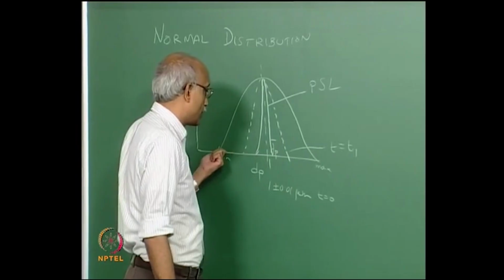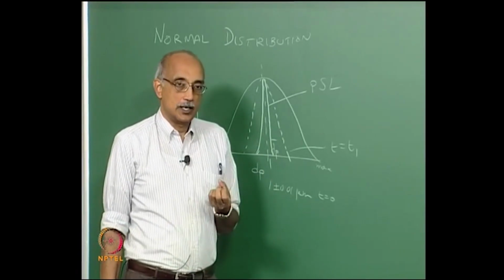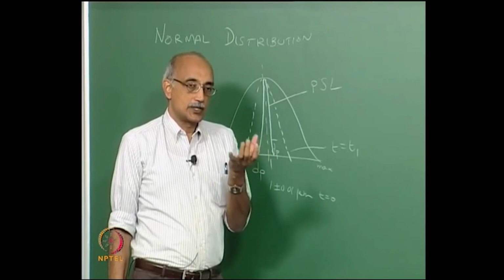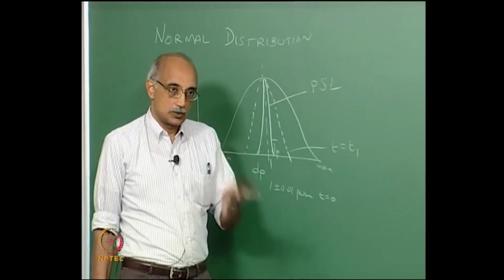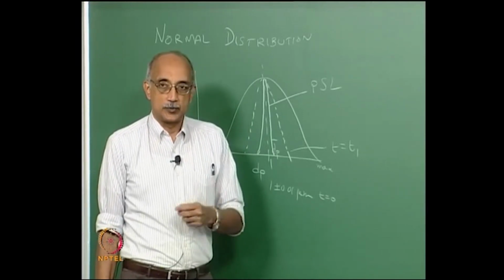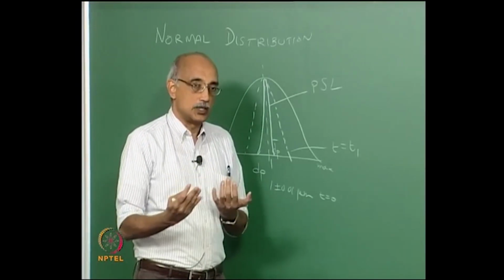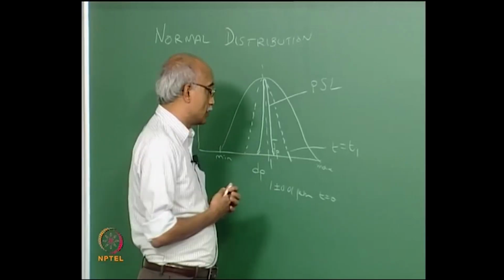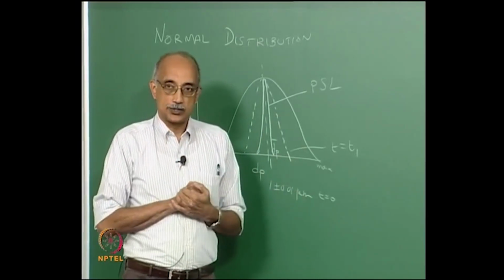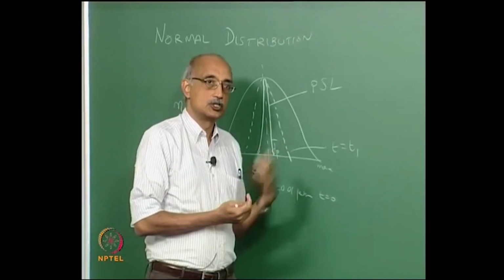Now, why do you see a broadening in this direction? That is predominantly because of settling as well as interception phenomena. So, if you have a beaker, many of the large particles will have a tendency to slowly sediment and essentially form a powdery layer on the bottom of the beaker. So, unless you keep resuspending these particles, you are continuously losing large particles. And also some of the particles are drifting to the sides and sticking to the walls of the beaker and so on. So, in effect it shifts the population towards the left.